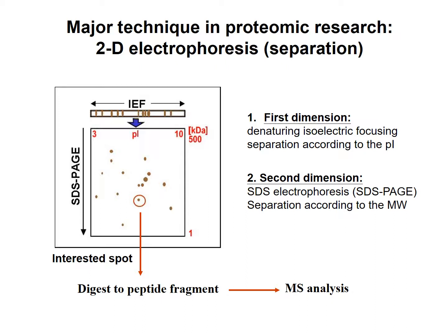Imagine two different cell types, cancer, non-cancer. One has a spot, one doesn't. You could actually do a peptide fragment digestion and look at the fingerprint and try to identify it, or we can do Edman degradation, E-D-M-A-N, and we'll talk about that. We've also talked about the mass spec, charge to mass ratio, to get a fingerprint. But anyway, there the spot is.